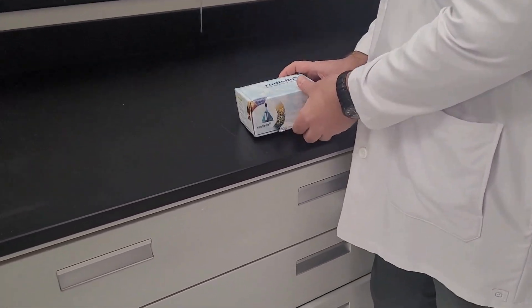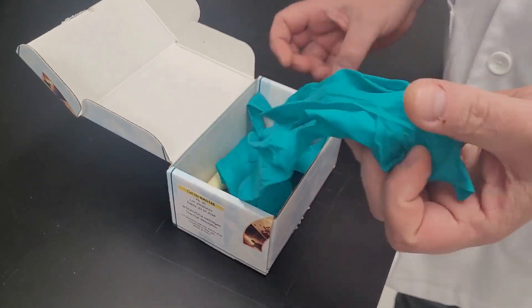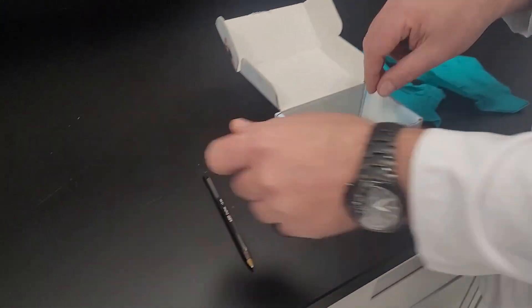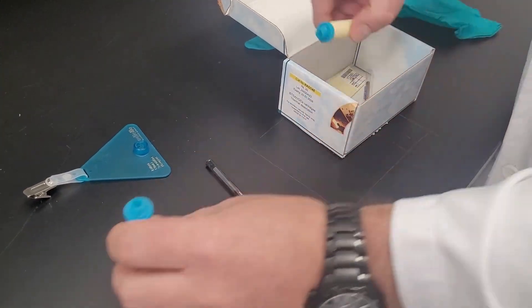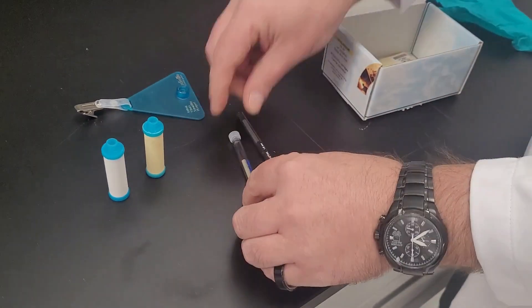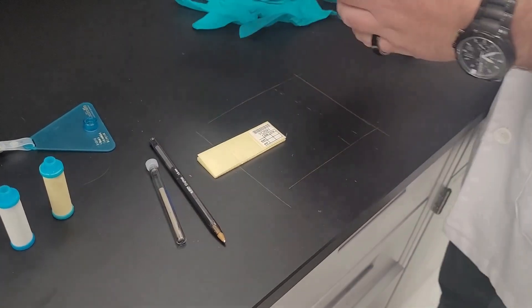You should have received this little box of Radiello samplers and inside of it will have everything you need to collect a VOC sample. Gloves, a pen, a stand with a gator clip, one of these two diffusive bodies, the sampling medium, and labels to write down your start and stop times.